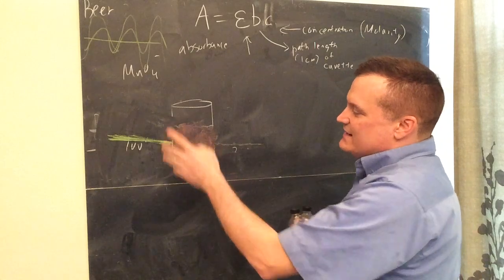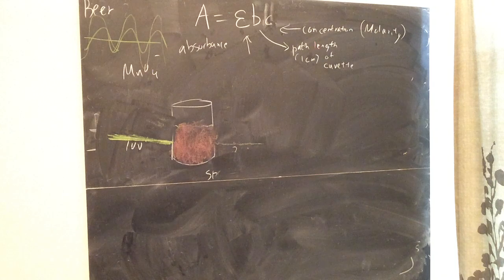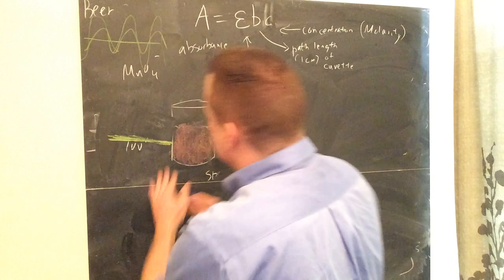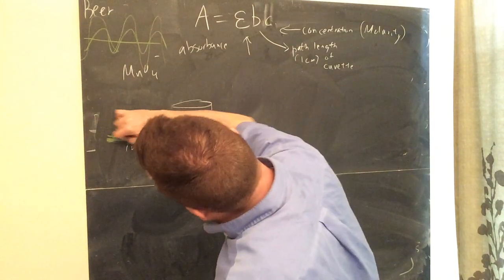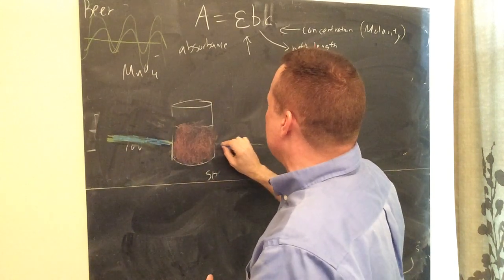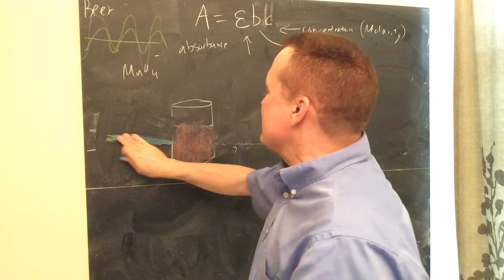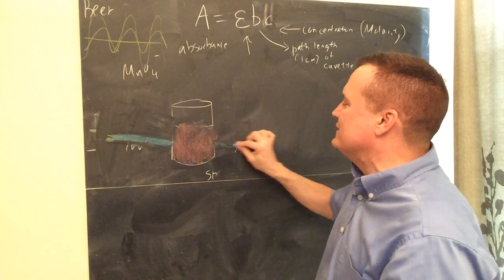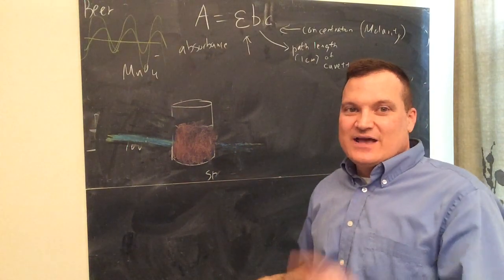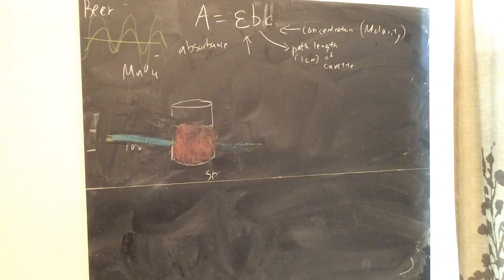A reddish orange. Now, for reddish orange color, if we go back to the color wheel, it turns out that the color that it absorbs the best is not green, but is a blue color. Maybe a greenish blue, actually. So that's the one that just barely will pass through. A bluish green color passes through. Maybe it's a cyan, like I was telling you. Kind of a cyan color passes through, and very little of it comes out. That is the optimal wavelength, 470 nanometers. That's the one that we will say you use for this lab.